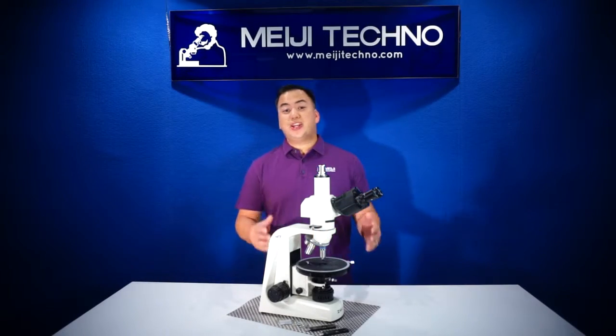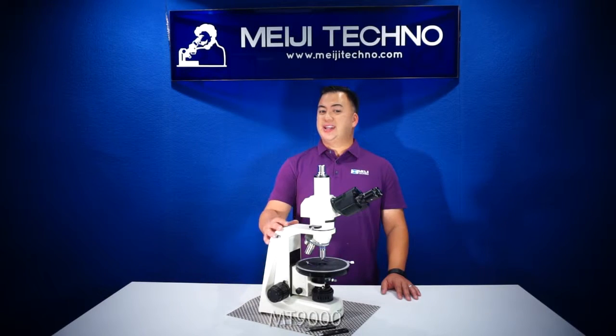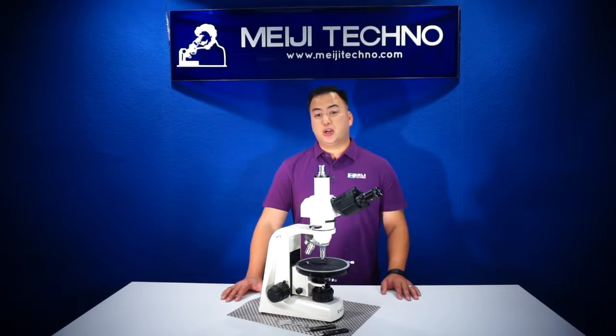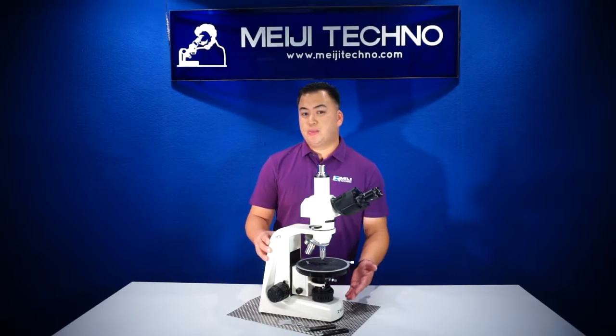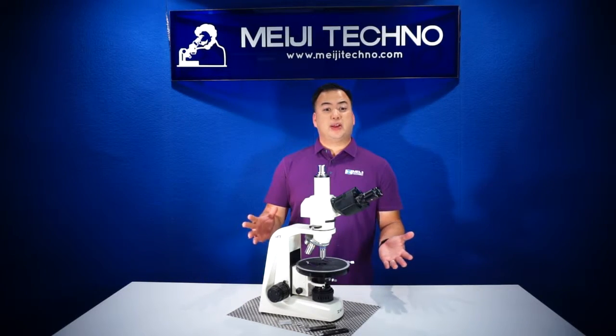Ohayou gozaimasu! Welcome to Miji Techno. Today we'll be discussing our new MT-9000 polarizing compound microscope series. The MT-9000 series is our most popular transmitted illumination polarizing microscope from our professional grade of polarizing microscopes from Japan.